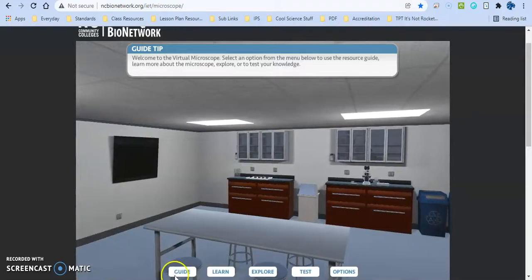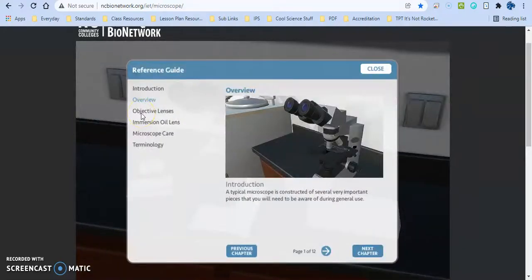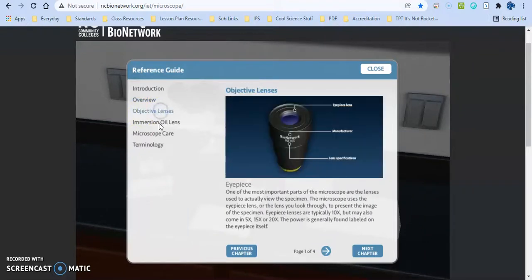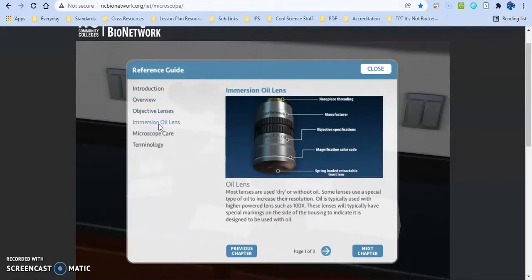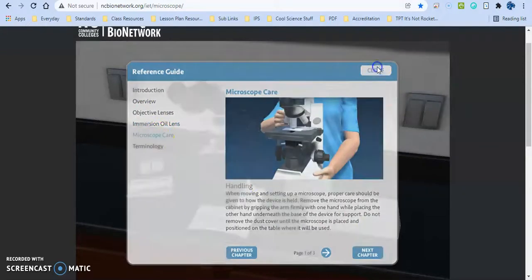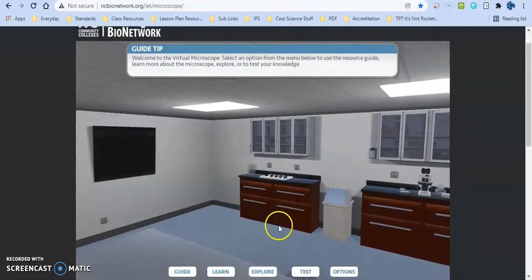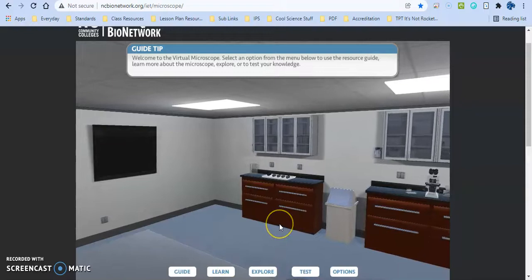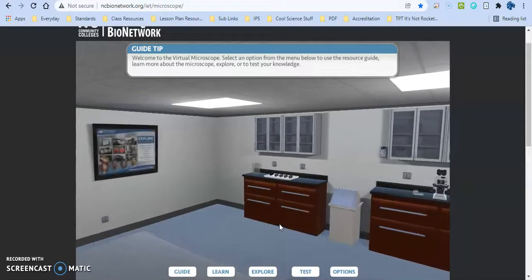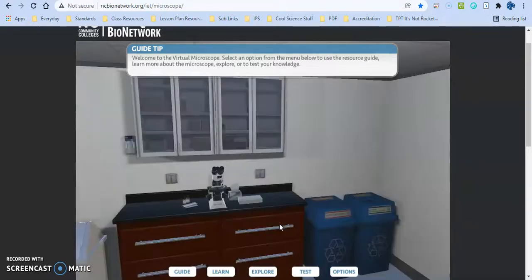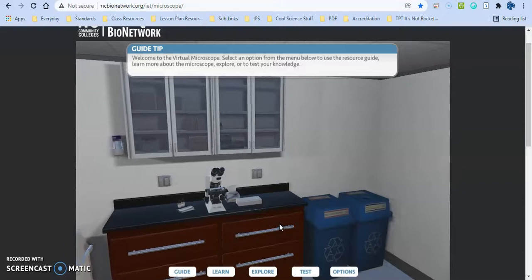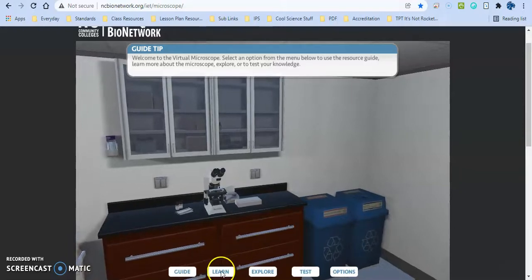The biggest thing behind this is you can learn about the actual use of the microscope, the different parts of it, why we use immersion oil, general care, some of the terminology. They can quiz themselves on it. There are some worksheets that you can give out to students that supplement with that.